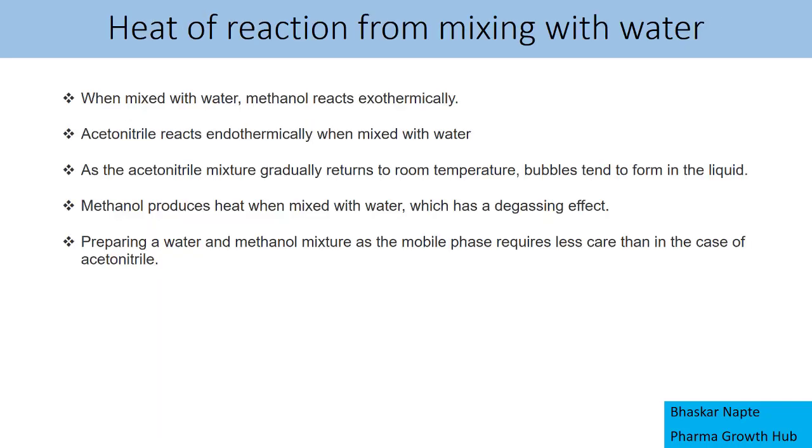Now let us understand the heat of reaction from mixing with water. When you mix methanol with water, what is the heat of reaction? Or when you mix ACN with water, what is the heat of reaction? When mixed with water, methanol reacts exothermically, and you must have seen the increase in temperature of the solution prepared. In the case of ACN, it is an endothermic reaction, and you will find a drop in the temperature of the solution prepared.